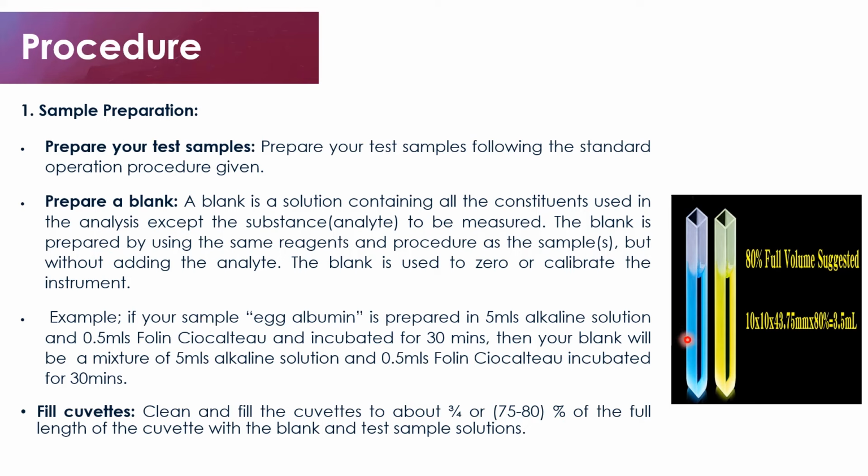From the cuvettes over here, we can see that this is our test sample and this is our blank over here. The difference between the color of our blank and the test sample is a result of the egg albumin, which is our test sample, reacting with the alkaline solution and the Folin-Ciocalteu reagent to give this blue color.